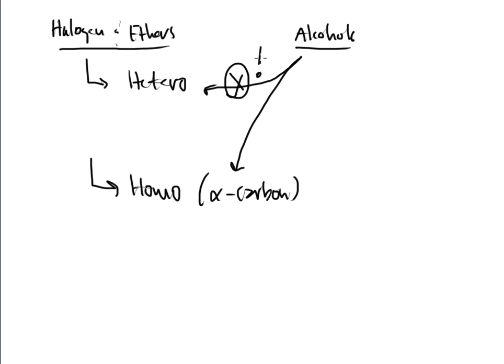So here I'm going to put an exclamation mark. The reason is because you will think in the beginning that it will be a heterolytic cleavage based on the numbers that we're getting. The problem is that something else is going to happen. And this is really given to those strange little protons that we talked about at the end of the last video. So, alcohols do homolytic. If you're comfortable with that, you'll be able to do these too. Alcohols do hetero in a way, but there's something extra that happens there in order to get them to do it. And we'll see that as well.